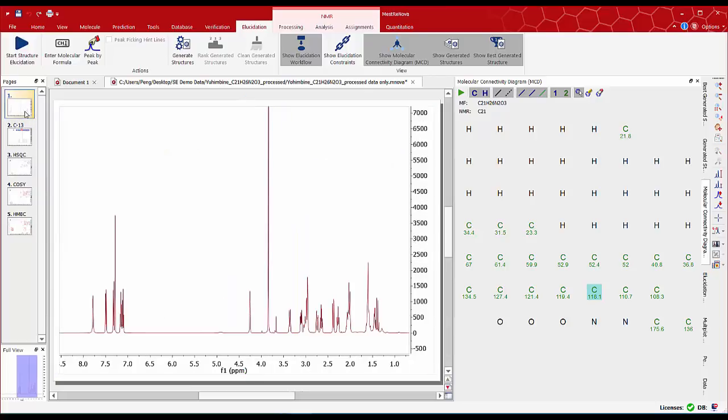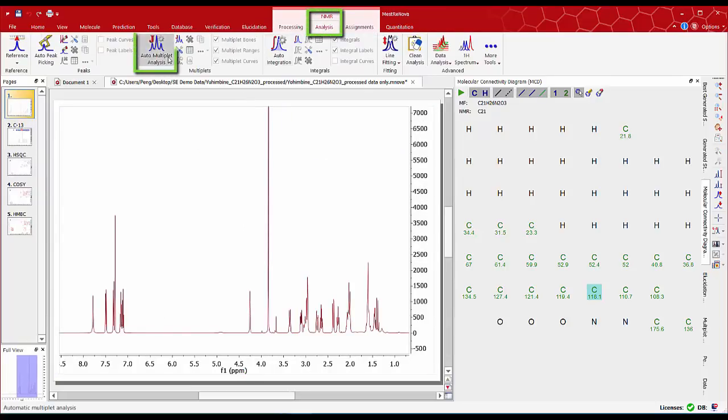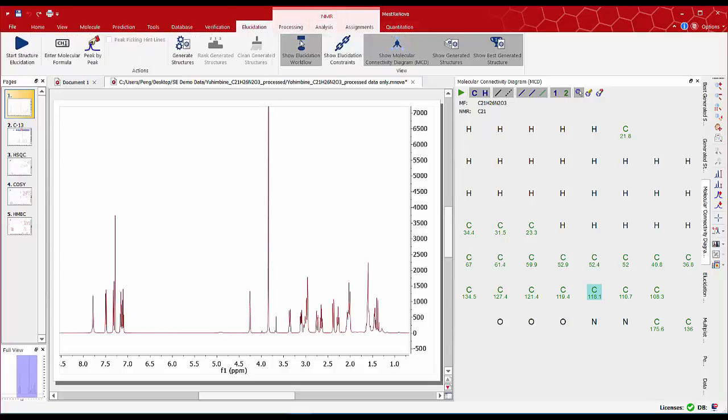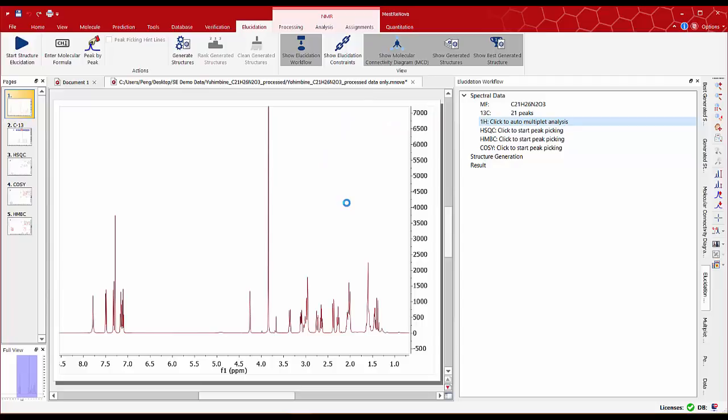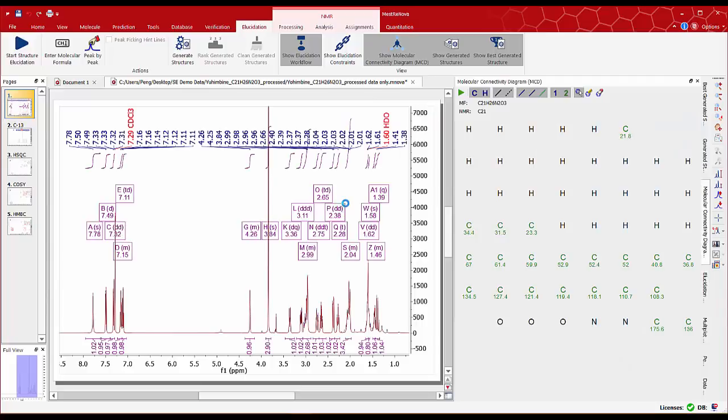Next we analyze the proton spectra. To do this we can either go to analysis and select the automatic analysis tool or use the structure elucidation workflow and select the 1H auto multiplet analysis. All proton multiplets are now analyzed and integrals normalized.